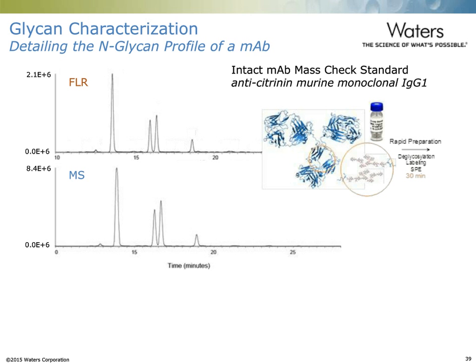Due to the poor ionization efficiency of glycans labeled with conventional labels, it is often difficult to detect, let alone characterize, low-abundance glycan species during HILIC ESI-MS analyses. But note here that the base peak intensity MS chromatogram in this analysis presented signal-to-noise comparable, actually slightly higher, to that of the fluorescence chromatogram, making assignment of the glycan species via accurate mass measurement straightforward.